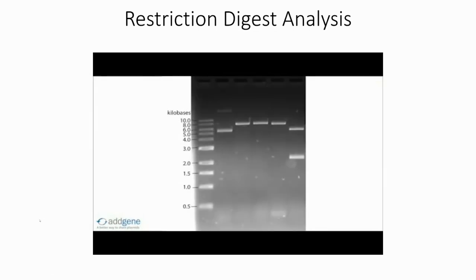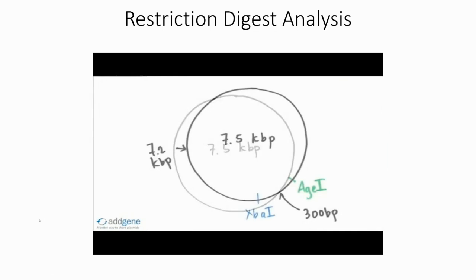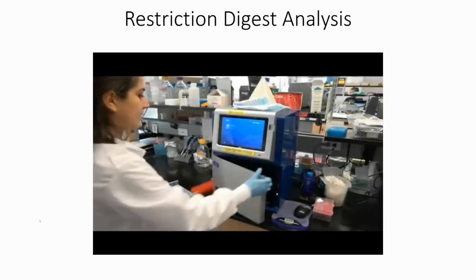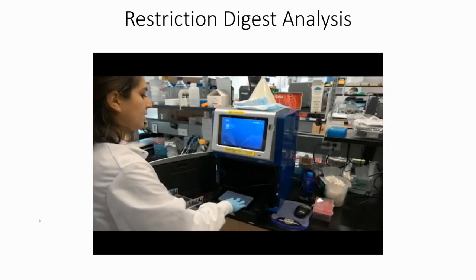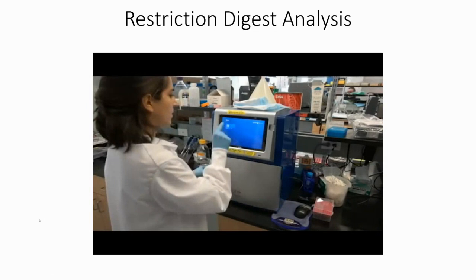While in theory and in textbooks restriction digestion is straightforward, interpreting the results of a digestion in practice is easier said than done. In this video, we will digest a plasmid of known identity with restriction enzymes, run the products on an agarose gel, and analyze the results. We'll focus on identifying the bands produced under different conditions and use the results to make conclusions about the plasmid. Now, let's start our analysis.